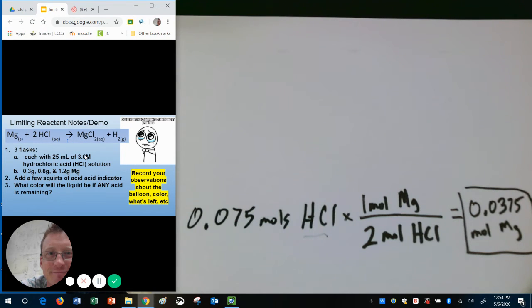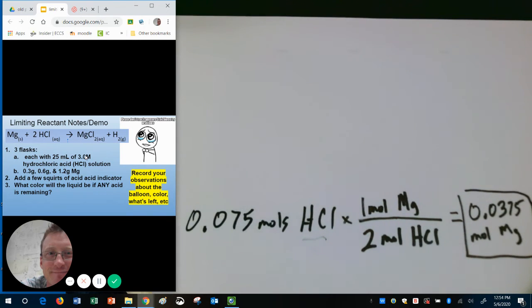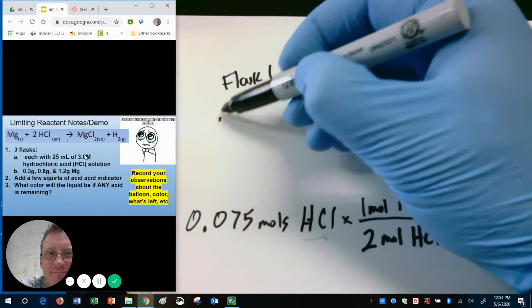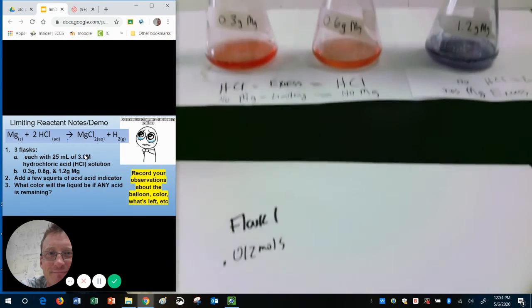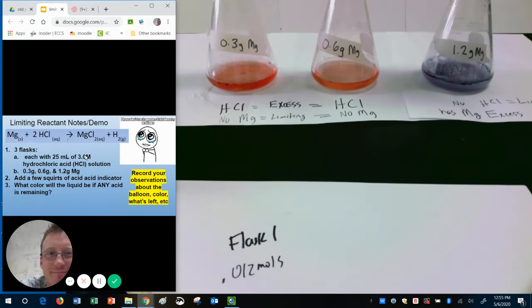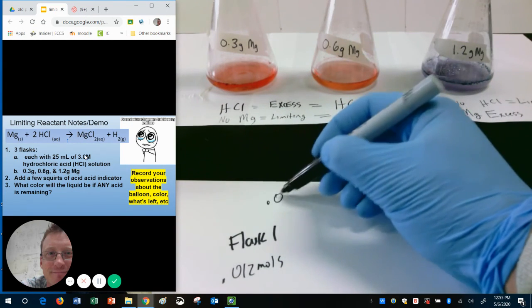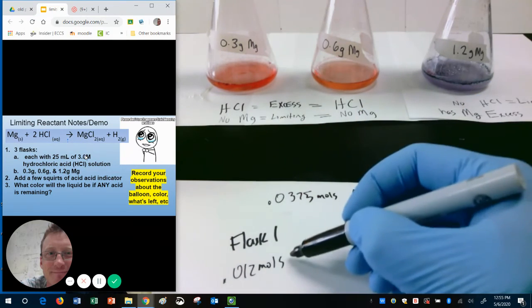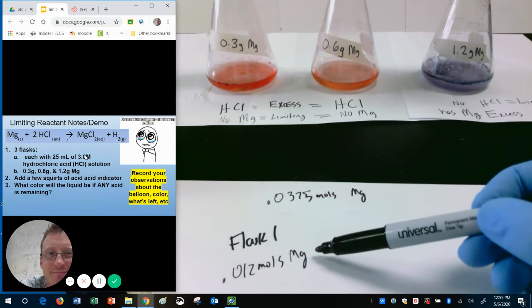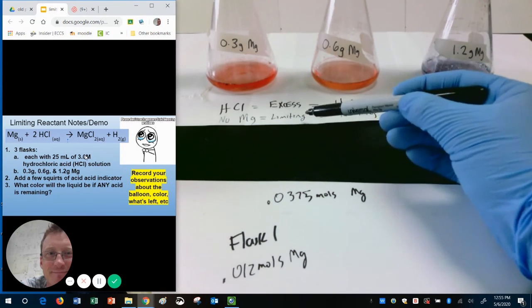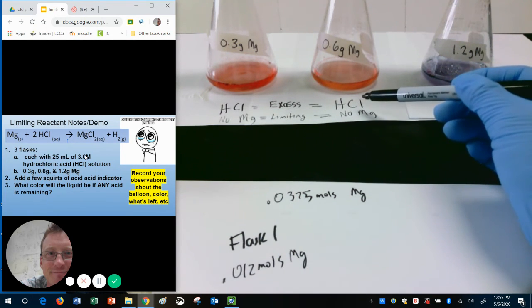Let's go back to our flasks. How many moles of magnesium do they have? In flask one, we have 0.012 moles. Why was there still excess HCl? Because we have enough acid to react with 0.0375 moles of magnesium, but we only had 0.012 moles of magnesium. We had more acid than we needed. Or another way to look at that, we have not enough magnesium to react with all of our acid. So the magnesium limits how much this reaction can happen. Acid in excess.